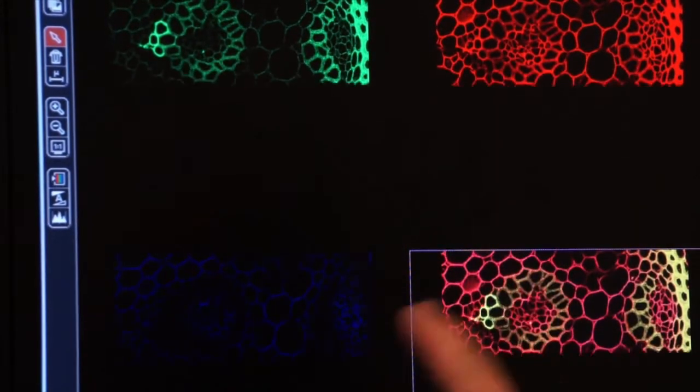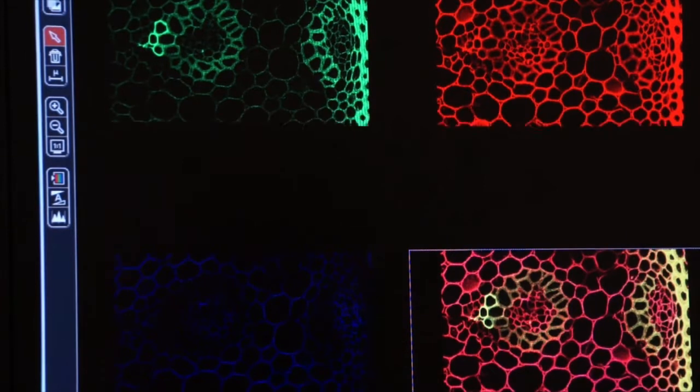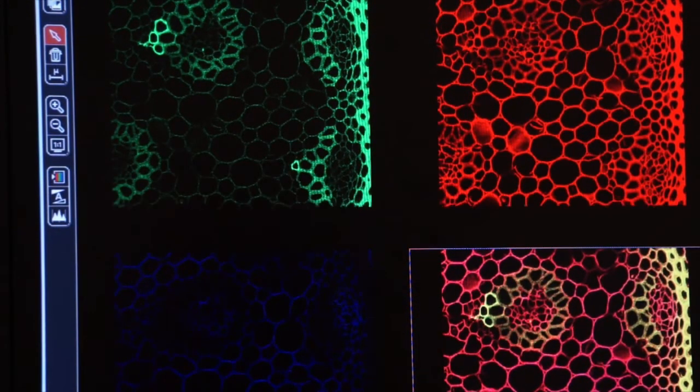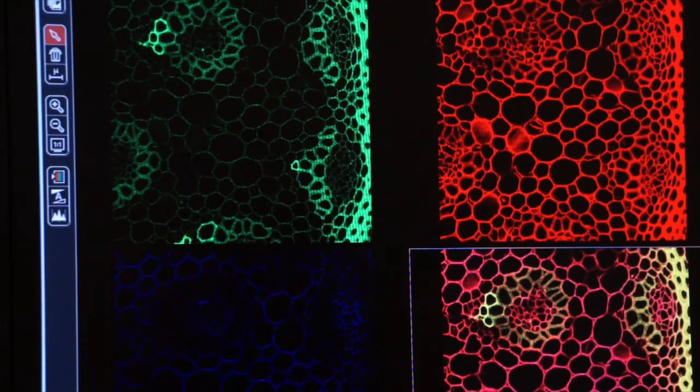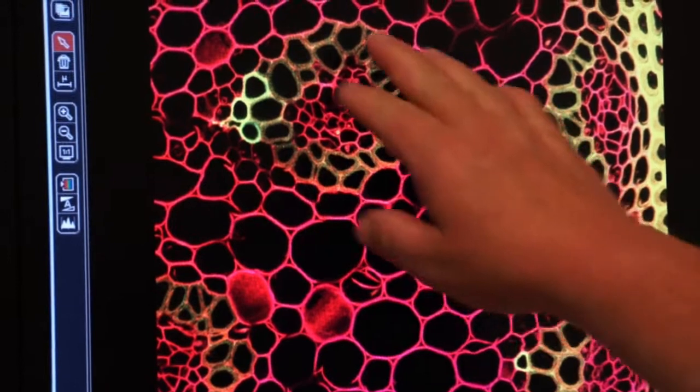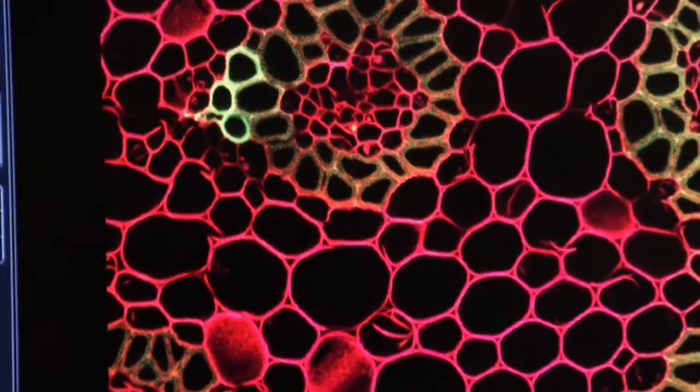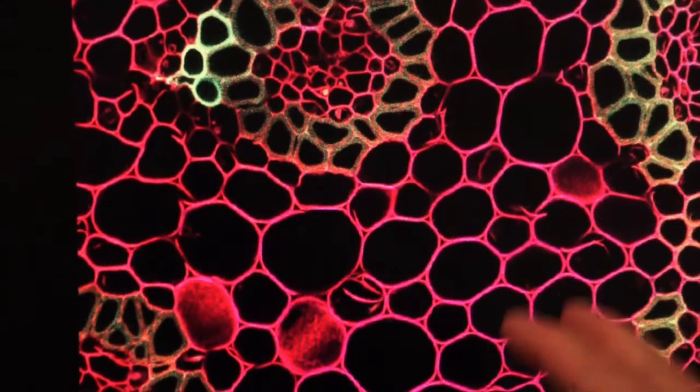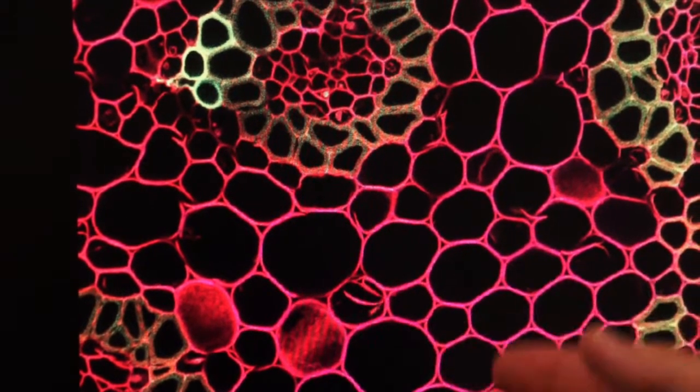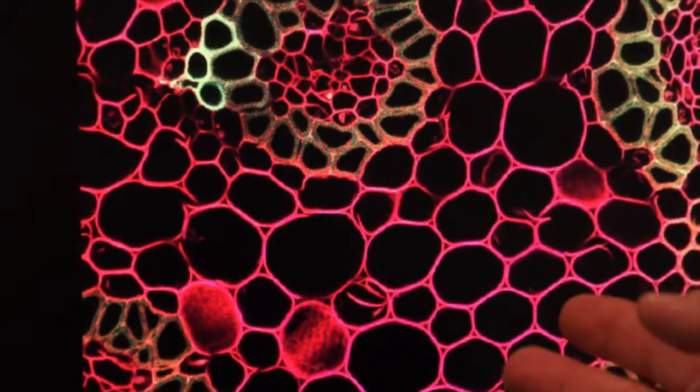Why? We're collecting five scans from each line and we're averaging those. Notice that the image is a lot cleaner. It's less noisy. So if we look on our composite image you see now a lot of that pixelation has gone away. So by increasing the resolution of our digitizer and increasing the line averaging we get a cleaner image.